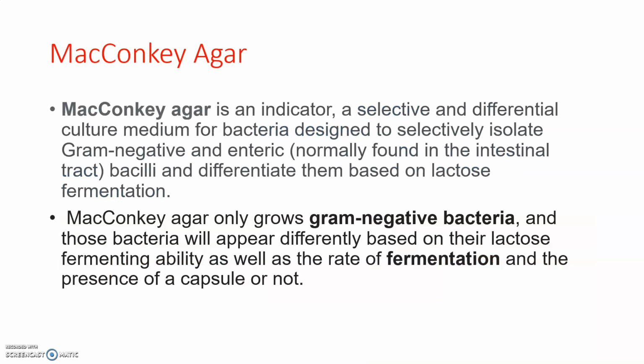Next is about MacConkey agar. MacConkey agar is an indicator and a selective differential culture medium for bacteria, and it is designed to selectively isolate gram-negative and enteric bacilli, and it may differentiate them based on lactose fermentation. So the MacConkey agar is an indicator.